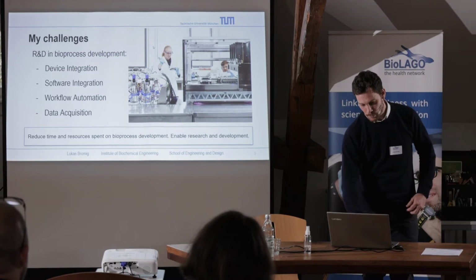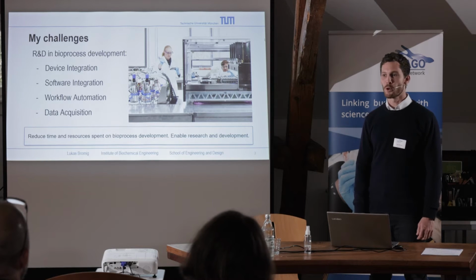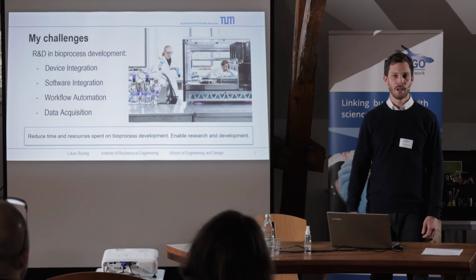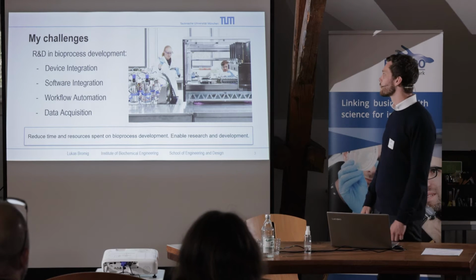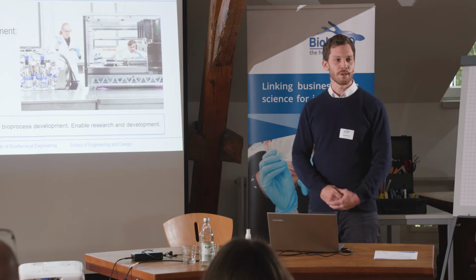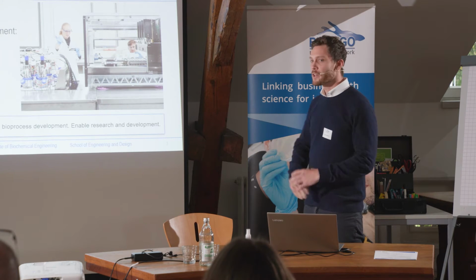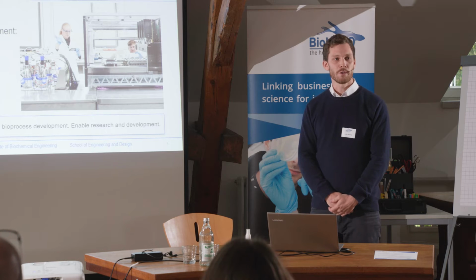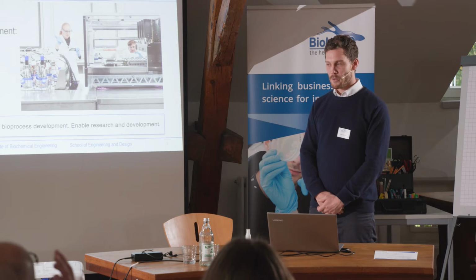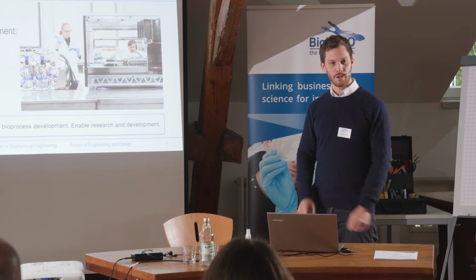When this all started, we were basically given a lab, a brand new lab with lots of equipment, but no software, no interfaces, nothing. So we were tasked with somehow making that all digital and automated so that we can speed up our process development. So we had about 8, 9 devices. We had no software whatsoever except the vendor software that was focused on that particular device.